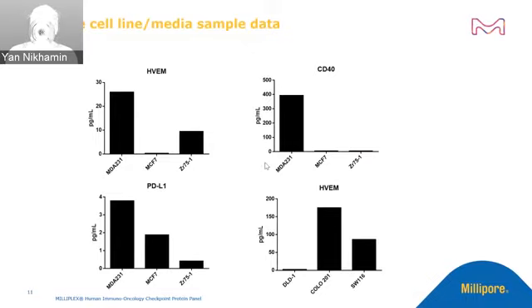And you could see that among the 3 different lines, they have a slightly different presentation of the checkpoints. Now, is this related to the particular stage that the breast cancer is in? Quite possibly. But this gives us a better picture and better understanding on what is going on within each stage of the disease progression. Slide, please.